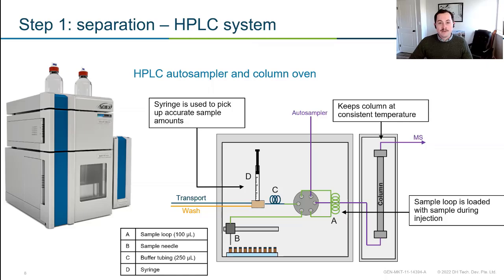So we store that column within the column oven. The reason we're doing that is just to make sure it's at a consistent temperature. As we increase temperature, typically what we see is a decrease in column pressure. And also our analytes are going to move a little bit faster through that column. So I'd hate to see a column be outside of a column oven and then your AC kick on and your room gets a little bit colder. That's going to mess with your retention time. So keeping it in a column oven, a little bit above your room temperature is usually what I would recommend.